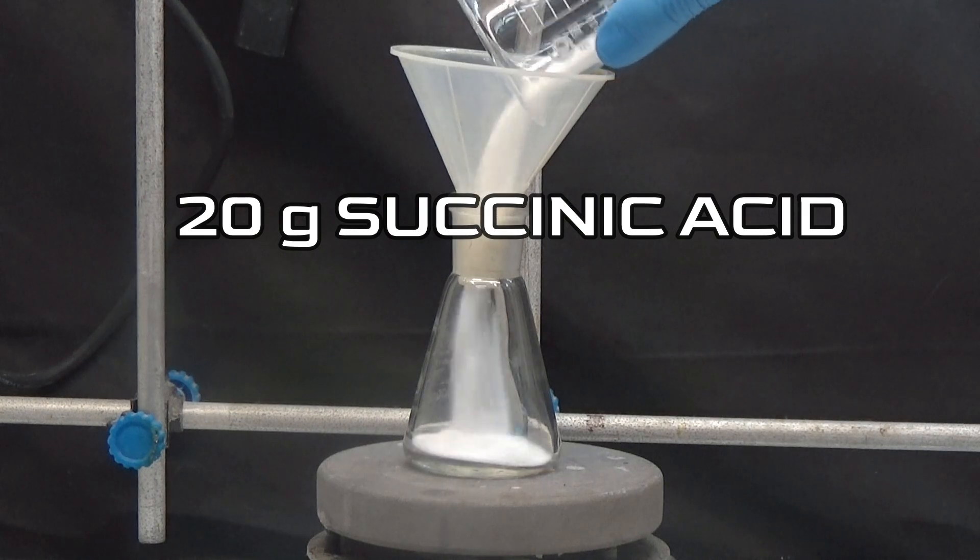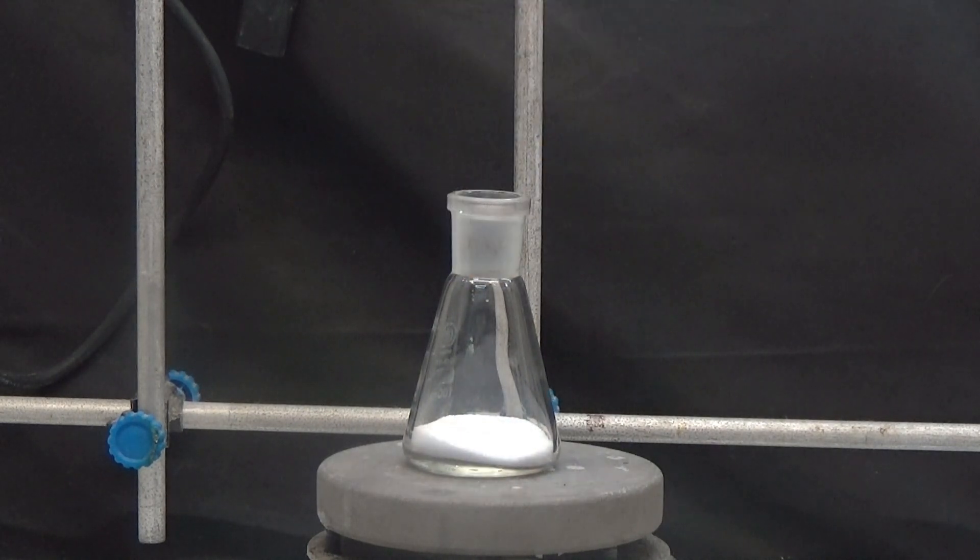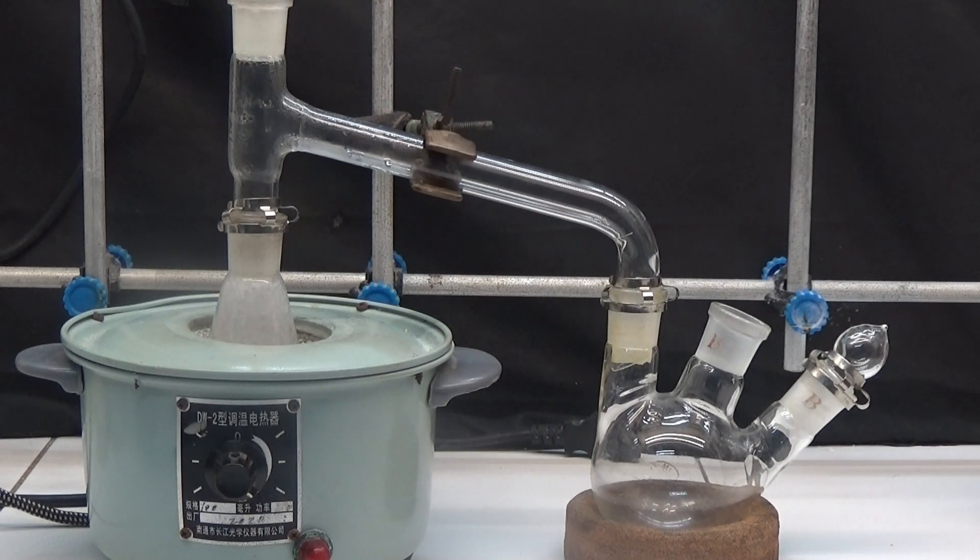In the first process, we will add 20 grams of succinic acid to a 100 milliliter flask. The distillation tube, which is 10 to 20 millimeters in diameter, is attached and a flask is used as the receiver.